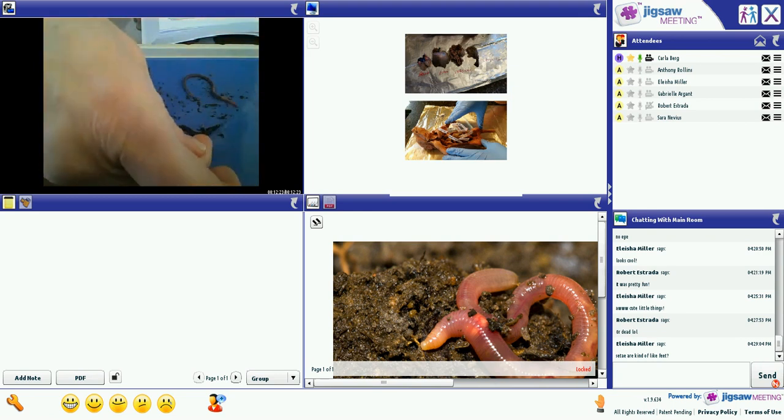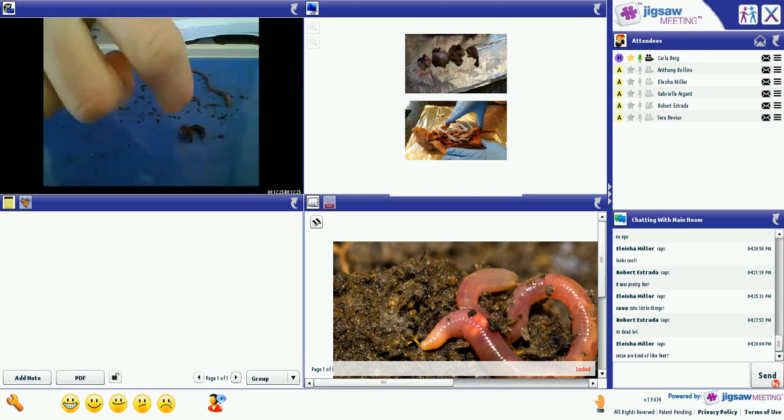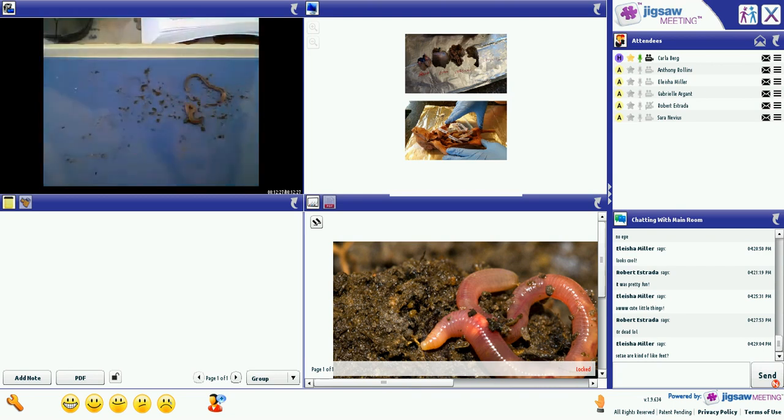Oh, they're both going. My vinegar line is right here. Oh, that worm got in it and is going away. And that worm never got in it, and he is going away as well. Neither of them like the vinegar line. Okay, if your worm did touch the vinegar, which I think this one did, go ahead and rinse it off so he doesn't get hurt by it.